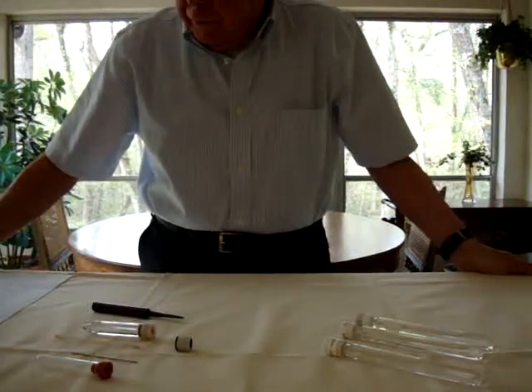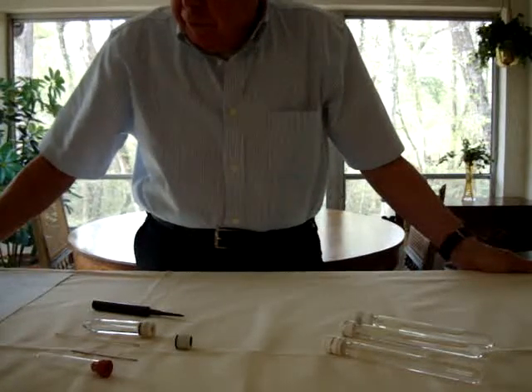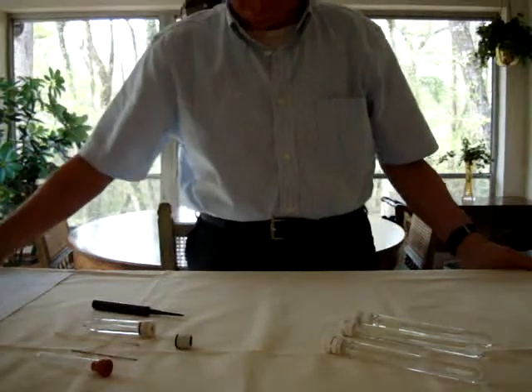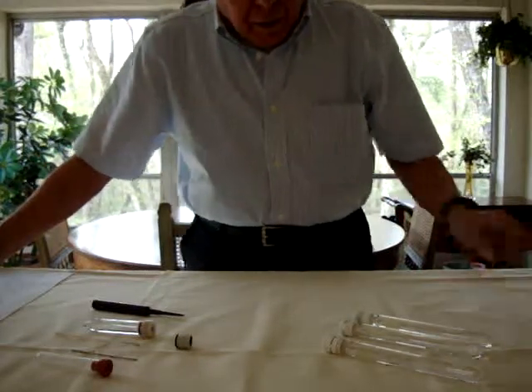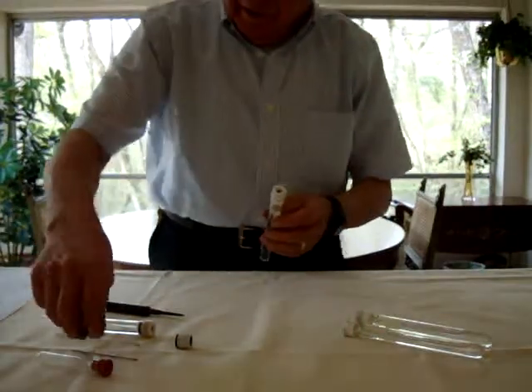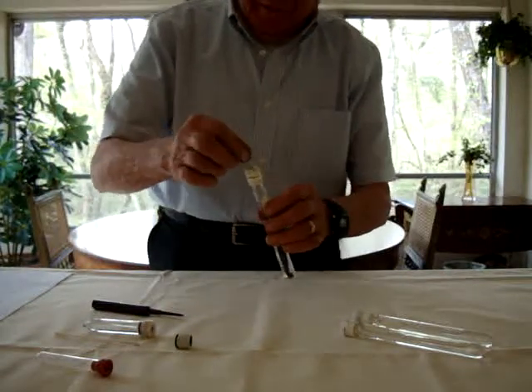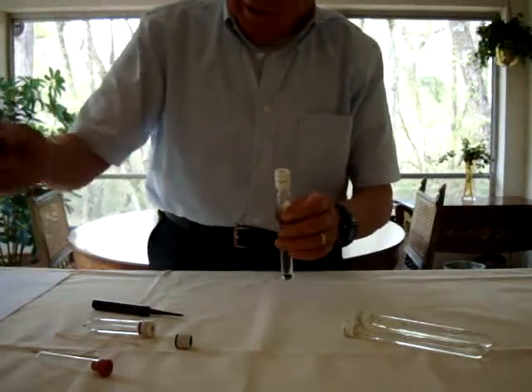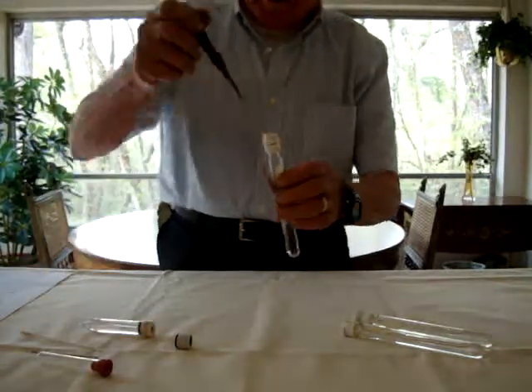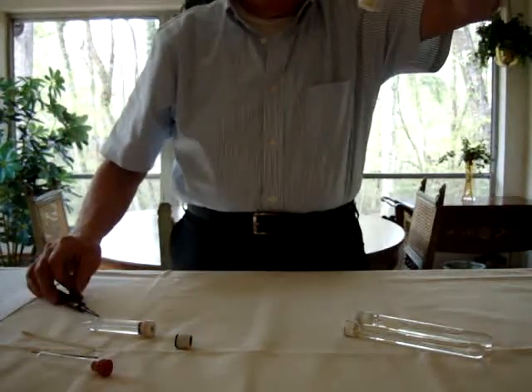This is the second video demonstration of Smart BioSeals. In an earlier video, I showed samples of Smart Seals built into screw cap closures — these are some examples. This is the latest one, and I demonstrated how they could operate with needle-like probes, larger probes, and more recently pipette type probes without leaking.